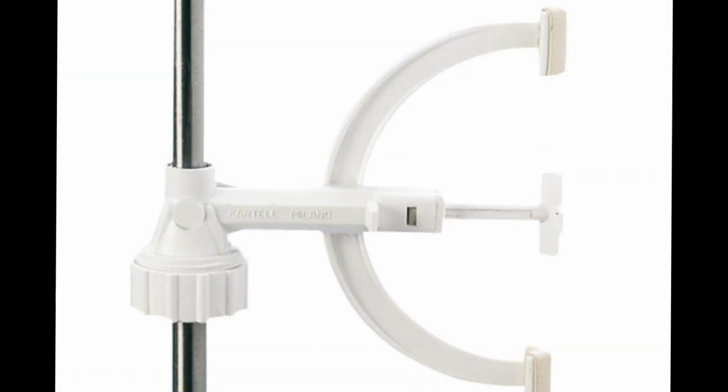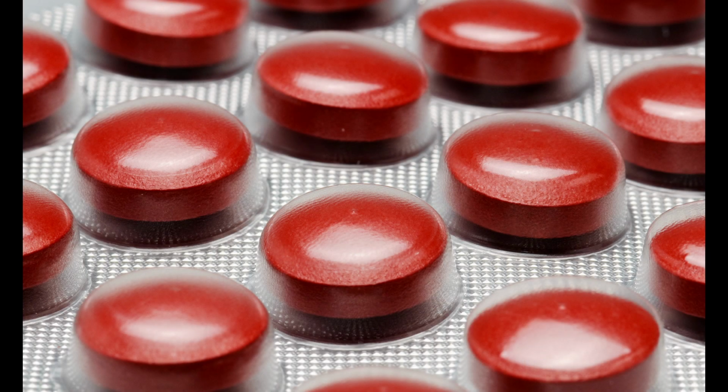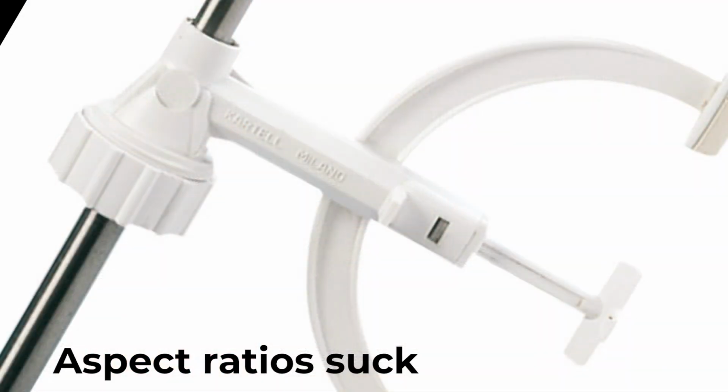I also had an issue of a loose burette holder which I simply fixed by adjusting a clamp under it to hold it in place. If I could, with some more time, I would prepare the iron solution in a lower concentration of sulfuric acid and allow it to dissolve the tablet overnight. I would also use a proper burette holder that's not broken to reduce any reading errors, as mine was on a bit of a slant, which I guess didn't matter too much as I still got an accurate result.